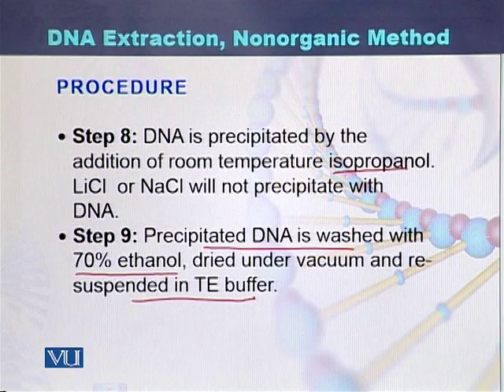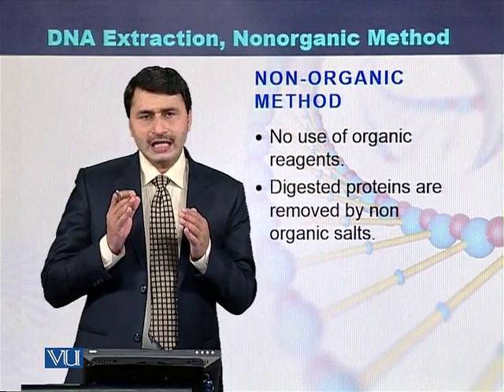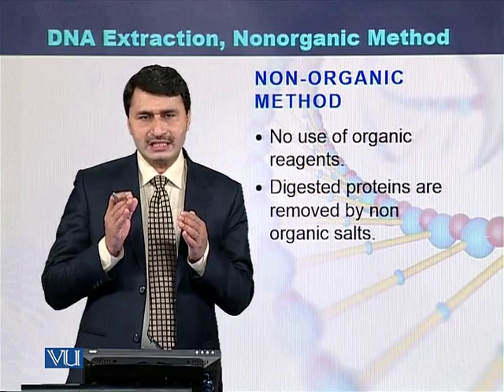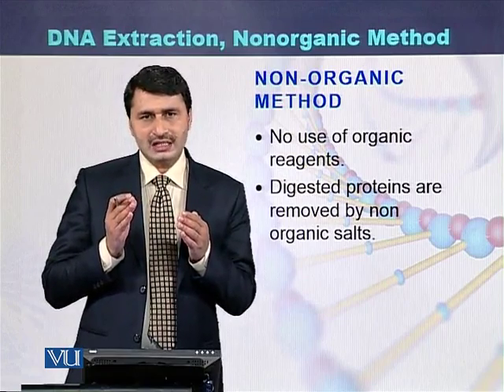Once DNA is precipitated, it is washed with 70% ethanol and dissolved in TE buffer for further use in molecular biology. So in the non-organic method, there is no use of organic compounds. Usually this procedure is completed with the help of an inorganic compound, and that is NaCl, sodium chloride. Digested proteins are removed by a high concentration of salts like NaCl.